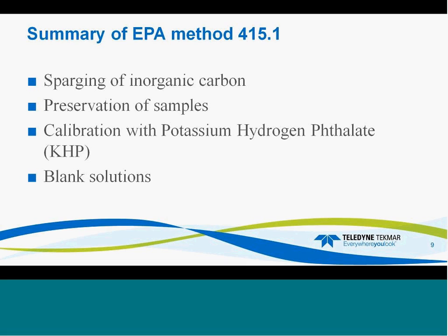Calibration is done with potassium hydrogen phthalate, called KHP. This is the same as 5310 also. It's calibrated with the same solution to be analyzed, and it's the same water used to prepare standards.